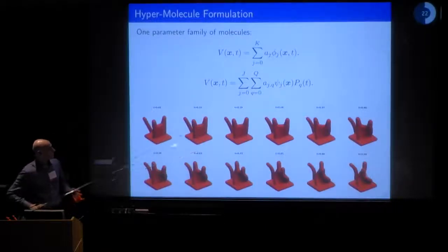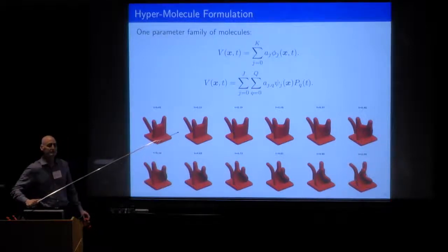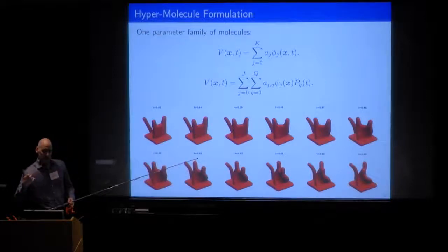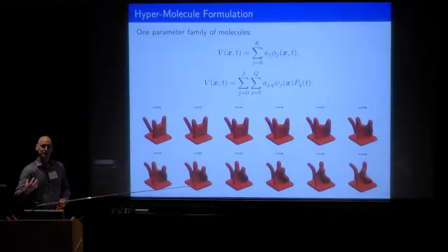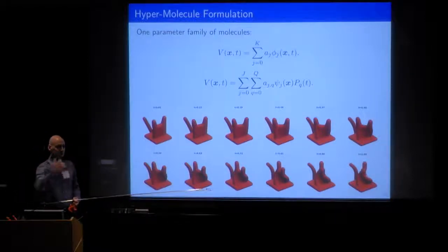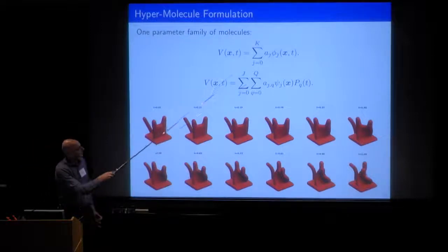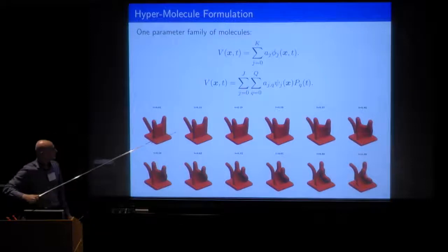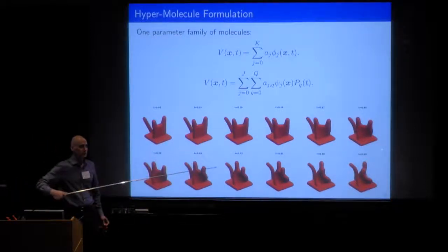And that's what makes this more pleasing to us, because what we can actually do here is, just as going from two-dimensional images to three-dimensional images, we switch from two-dimensional basis functions to three-dimensional basis functions, from two-dimensional functions to three-dimensional functions. Here we can switch from three-dimensional functions to four-dimensional functions that capture this continuum, this smooth transition between different states.